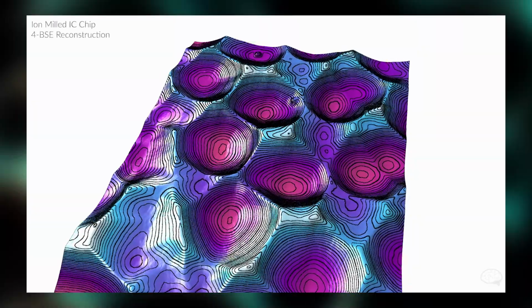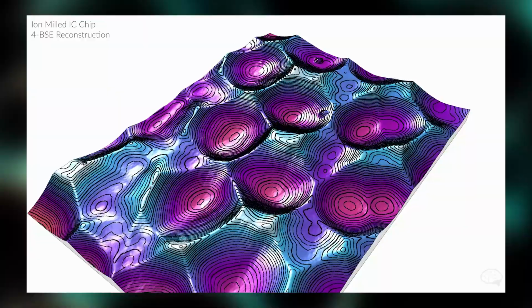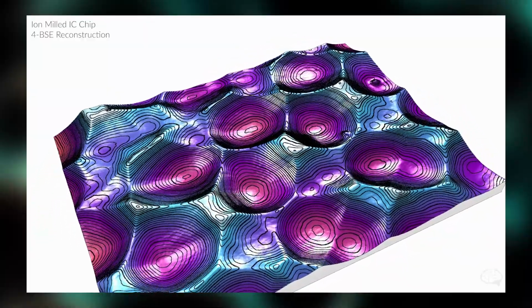Greetings, microscopists. This is Eric Miller from Instructinate, and today I'd like to talk about 3D surface reconstructions of samples using the SEM. Now, to make a surface reconstruction, we'll need to use special software. There are several different pieces of commercially available software to do this. However, for this video, I'm not going to discuss any specific piece of software.